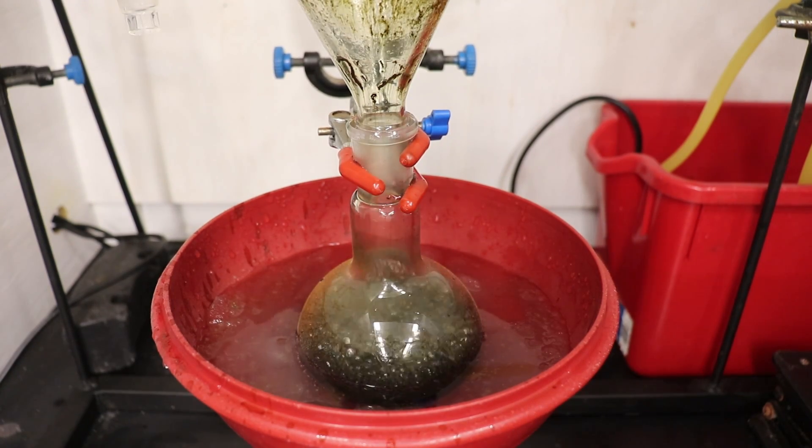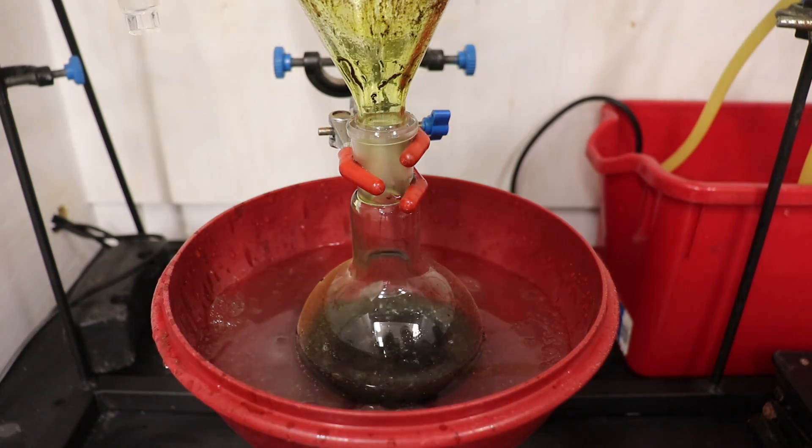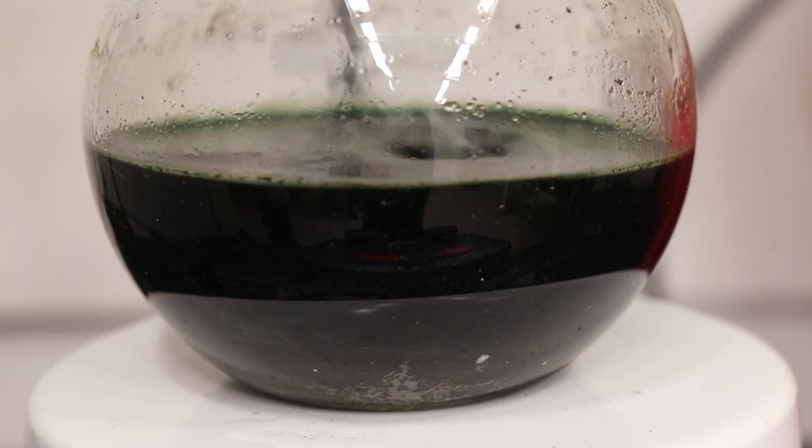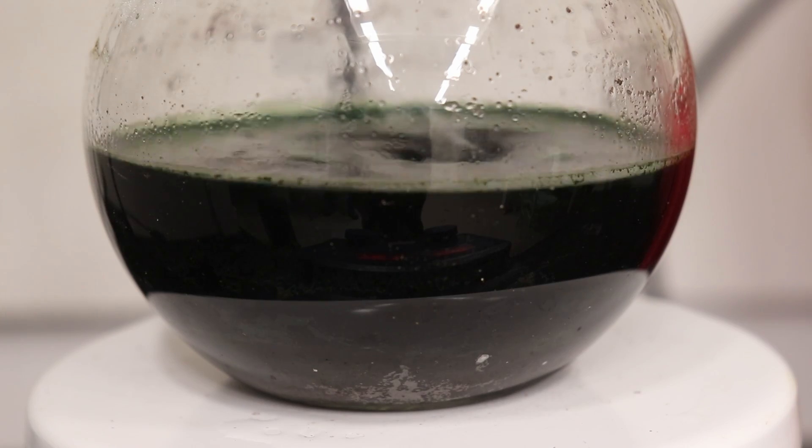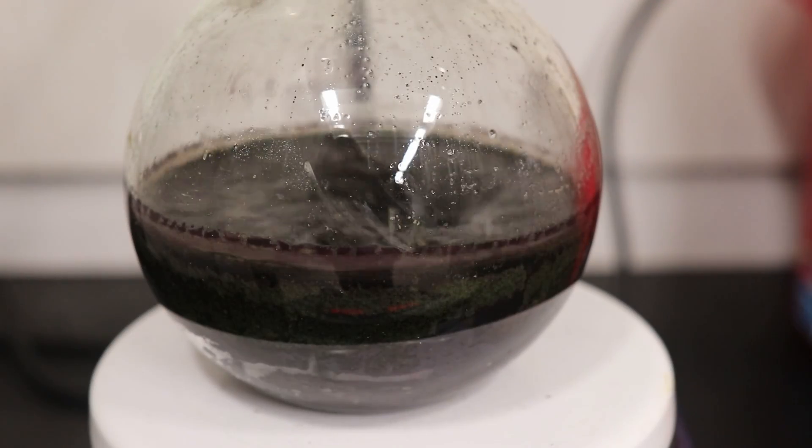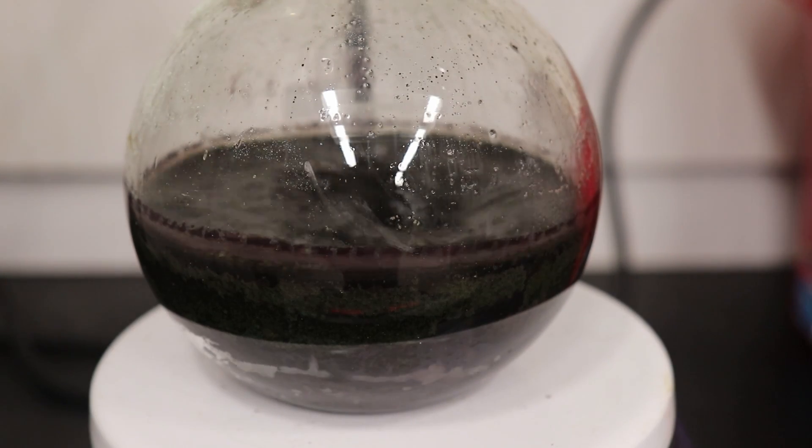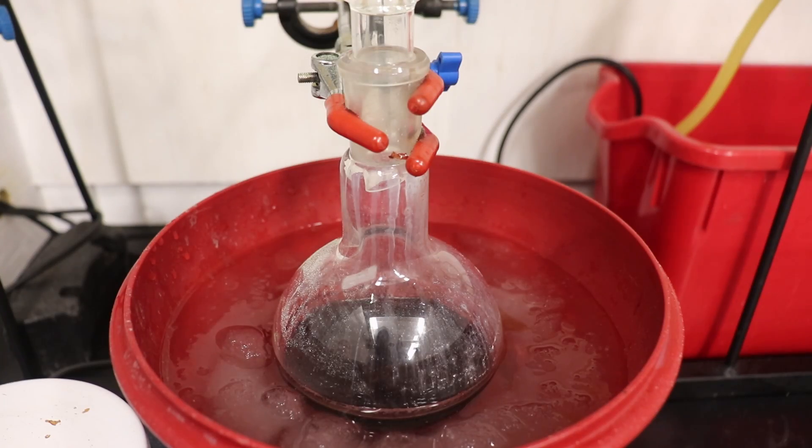The funnel was then swapped out for a condenser and the mixture was refluxed for one hour. Over time, the coloration of the solution changed from a dark green to a brown with the formation of a thick deposit at the bottom of the flask. The flask was then cooled in an ice bath.